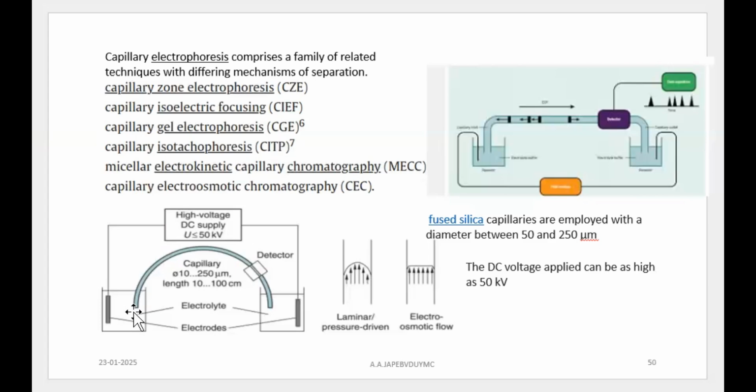Positively charged ions or analytes will move to the cathode first. As separated molecules approach the cathode, they pass through a window where they are detected by detecting systems. So as in analytical ultracentrifuge systems, you have an analysis window or viewing window, and the centrifuge is attached with a spectrophotometer, for example.